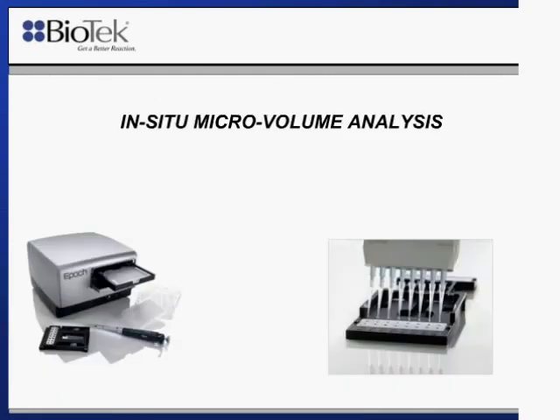So as I mentioned earlier, I wanted to also introduce you to a few methods to increase the dynamic range. We know that we're somewhat limited in the ability to quantify samples at very, very low concentrations. I also touched on the ability to measure samples at very high concentrations using the shorter path lengths, but the opposite is also true. It's more difficult to quantify low concentration samples using a shorter path length. So we might need to use some enhancement reagents to increase the dynamic range if we still want to conserve sample. So I'll introduce you first to the in situ PicoGreen assay that we developed here.